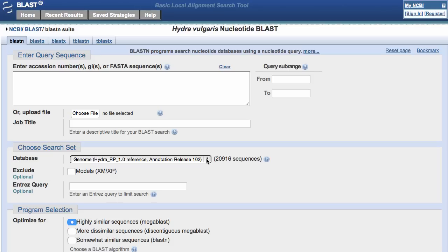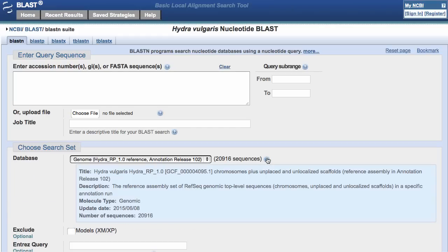The idea is that this takes me to the best genomic set for Hydra vulgaris. By the way, Hydra vulgaris can regenerate its head, which I think would be a really awesome superpower. Now that I'm on the search page, I'd like to point out a few features. Note that the menu has pre-selected the genome, and I can select the question mark to see information on the assembly I'll be searching.